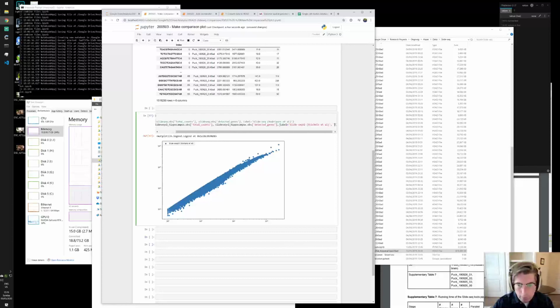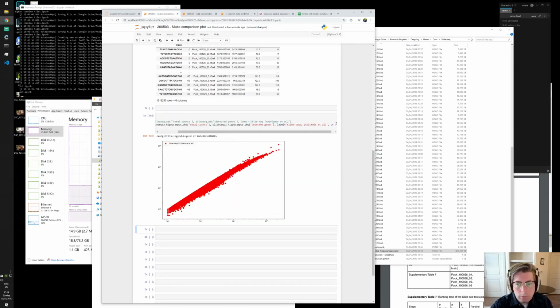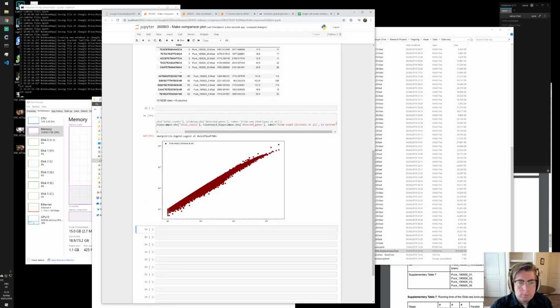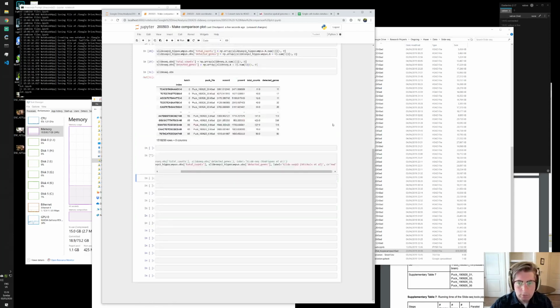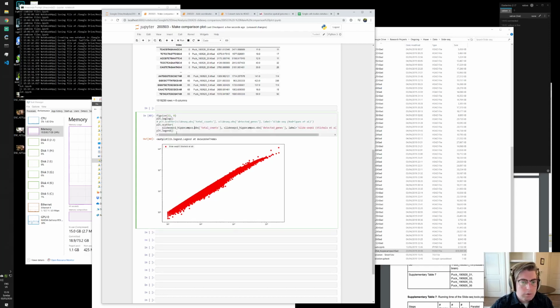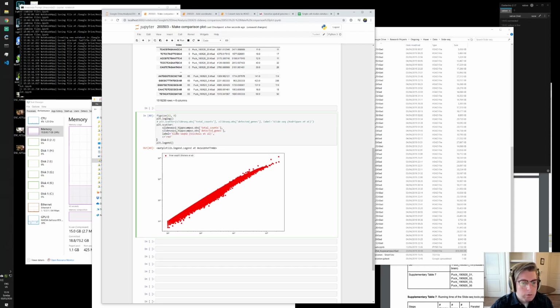Okay, I'm going to manually set the color to red for version 2. Though I like dark red. No, it's red. This is actually getting busy, so I like splitting things up. So I see all of the options.